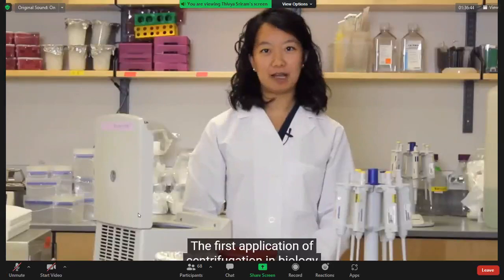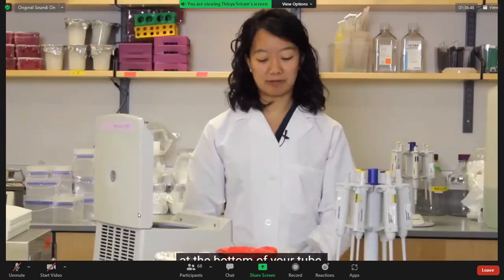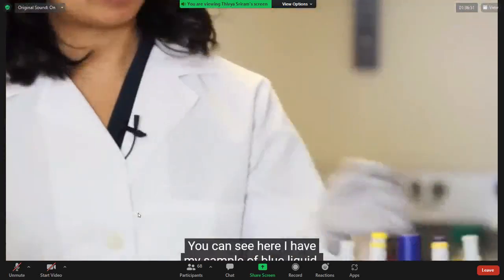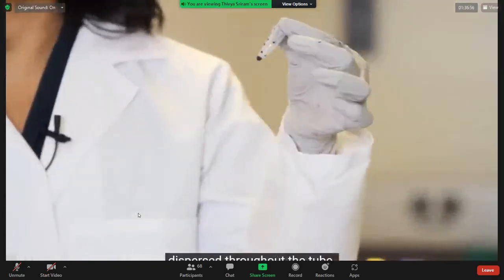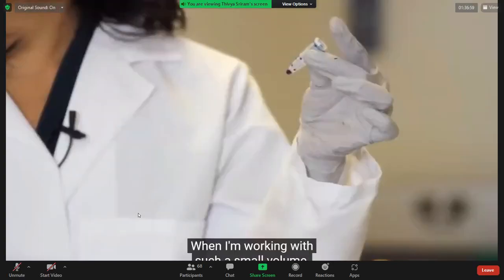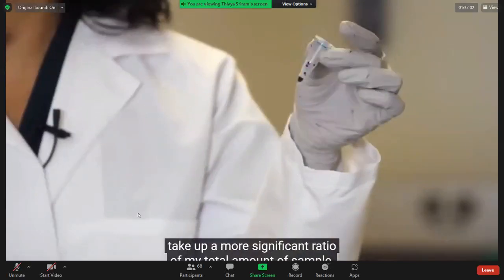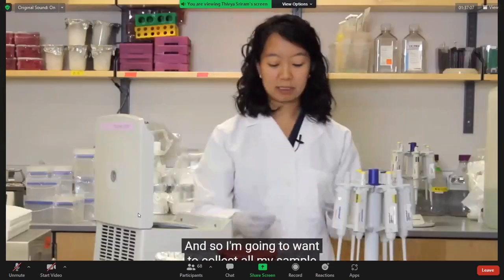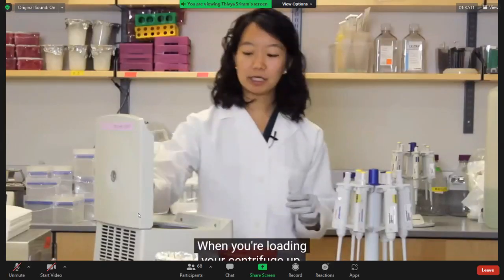The first application of centrifugation in biology that I'm going to show you is the collection of samples at the bottom of your tube. You can see here I have my sample of blue liquid. If I shake up my tube, my sample will be dispersed throughout the tube. When I'm working with such a small volume, these tiny droplets will actually take up a more significant ratio of my total amount of sample and can make a big difference in my experiment. And so I'm going to want to collect all my sample at the bottom of the tube.